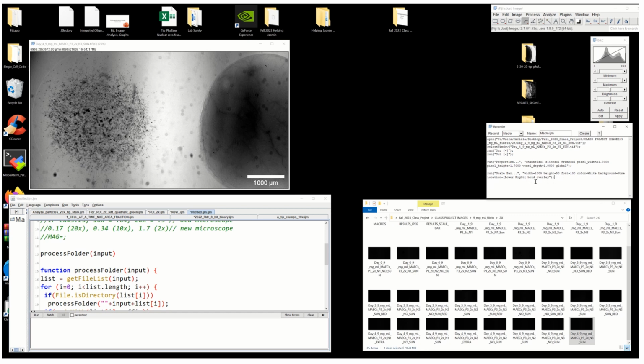Okay, so we have our 2 lines of code that we want. The run properties line, where we set the scale to 1.7 when we calibrated, we want that line of code. And then we created the scale bar and put it on the screen. So now we went ahead and set that. This is the only code that I want, so I'm going to take that and press Control C to copy.